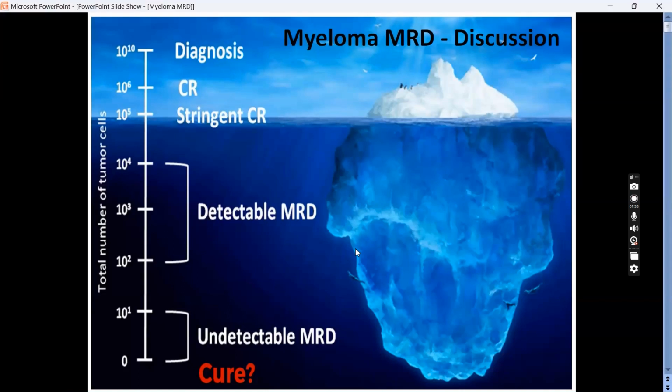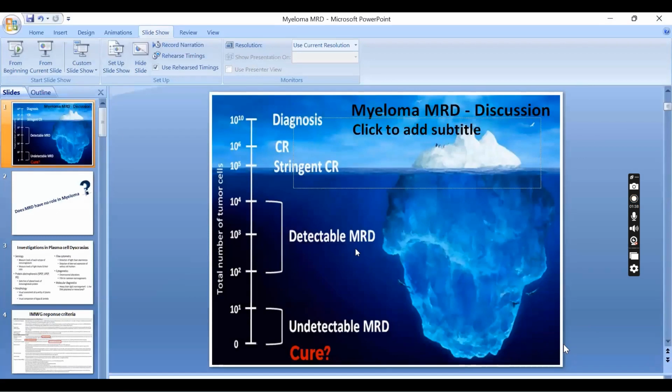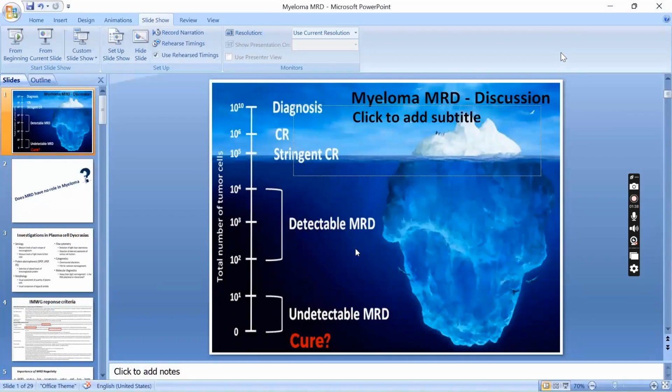So, do we have time? It's time, so we'll close for today because this LOD, LOB has almost confused everyone. Tomorrow we'll check MDS and also cover some myeloma MRD, because now live myeloma MRD analysis cannot be taken.